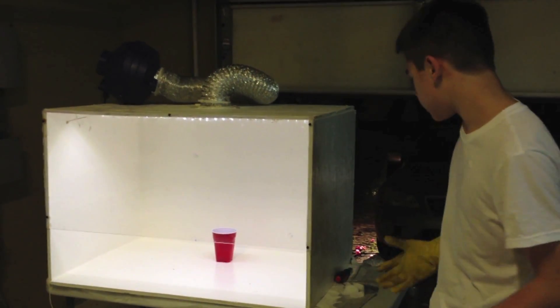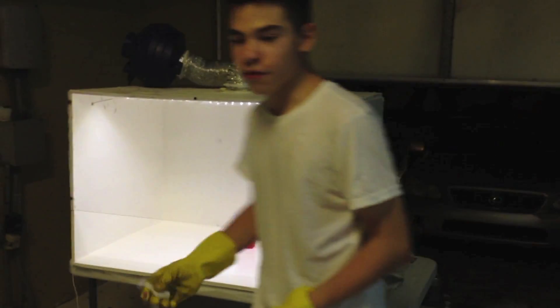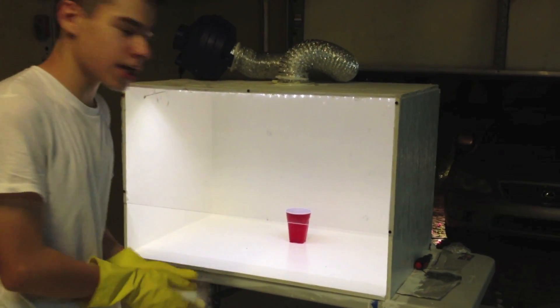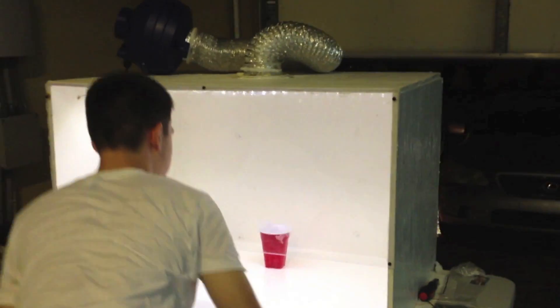Right now we're going to go ahead and test it using some dry ice. When we put dry ice in this cup of water, it's going to produce a fog, which is water vapor condensing. And now we're going to test how strong the hood is.